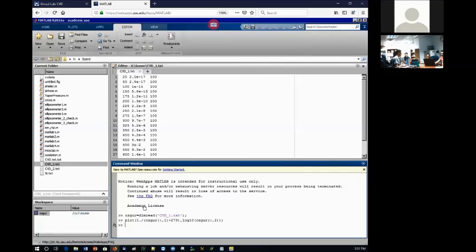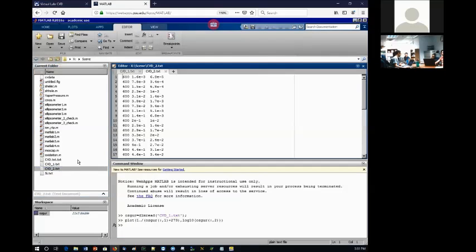Now let's do one more thing. We're going to try to attain another plot. That's going to be the CVD2 plot, CVD2.txt. In this case, we're going to fix the temperature. As you can see, it's going to be 600 degrees. We're going to increase the pressure, and then we're going to start to record the growth rate accordingly.